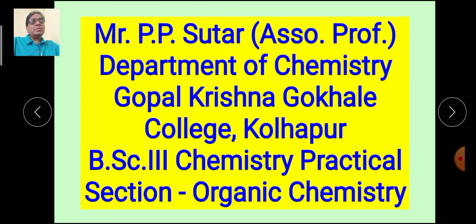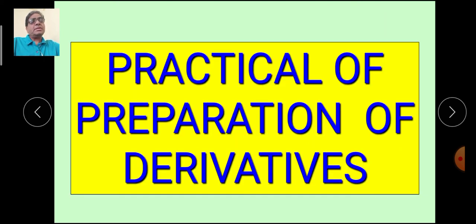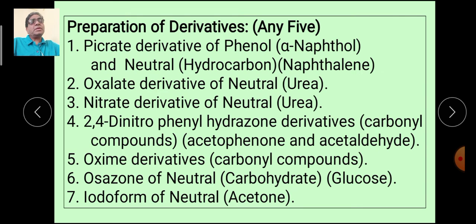Here we are going to see another variety of practicals, that is practicals of preparation of derivatives. For your study, these are the derivatives. The first one is picrate derivative of phenol. You are going to prepare the picrate derivative of alpha naphthol and picrate derivative of neutral, that is hydrocarbon naphthalene.